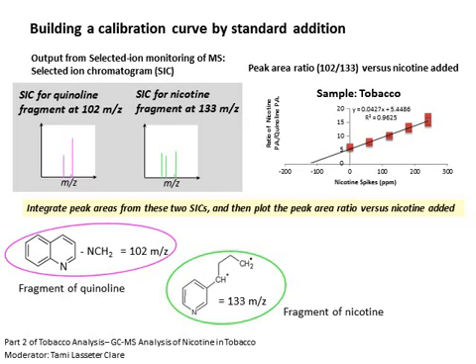We add a known amount of quinoline to our samples, and that concentration will be constant throughout the experiment. We assume that as the amount of quinoline that gets through the GC column varies from run to run, so too does the amount of nicotine, and so the two track nicely. Taking the ratio of peak area of nicotine to quinoline corrects for the variation in the absolute peak areas for each in each run. We get much better statistics on the fit for the line when we do this.